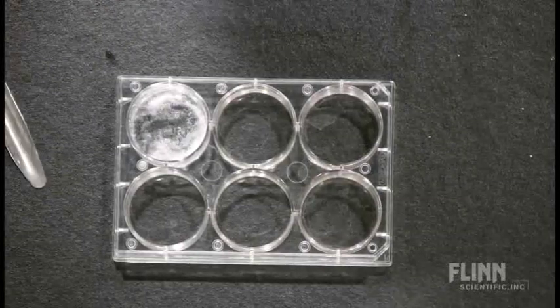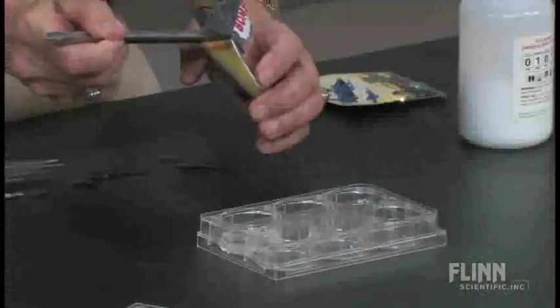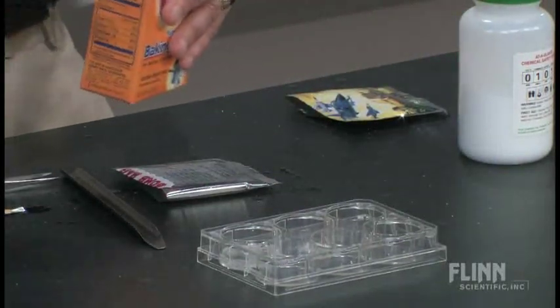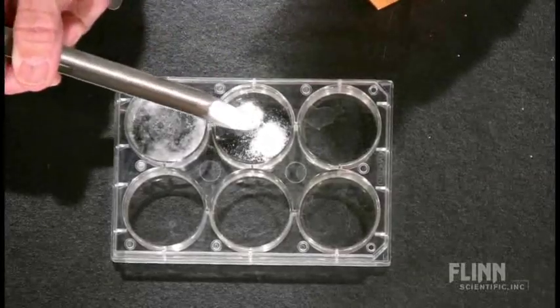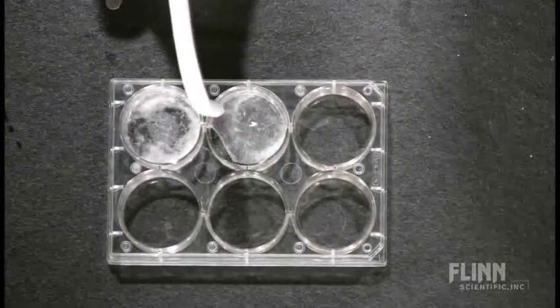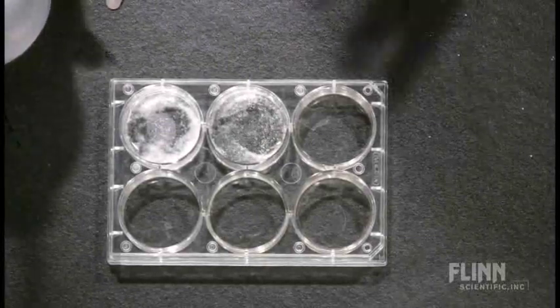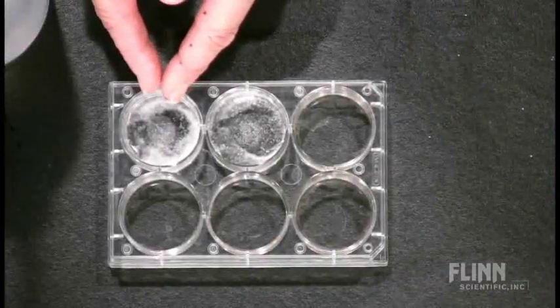And now let's take and add the same bomb bag solid. Only this time, let's add some baking soda, and add some water. Not much seems to be happening there. And the reason we're doing this is to see if that white solid happens to be citric acid. If I added baking soda and water, I should get fizzing. If the solid itself had a mixture, I should get fizzing with just plain water.